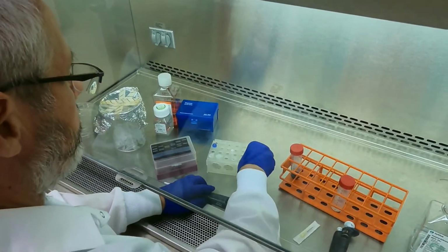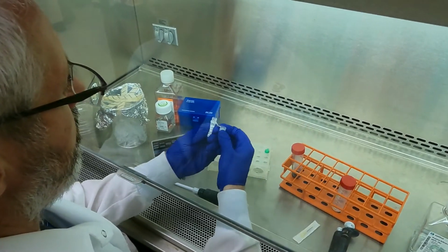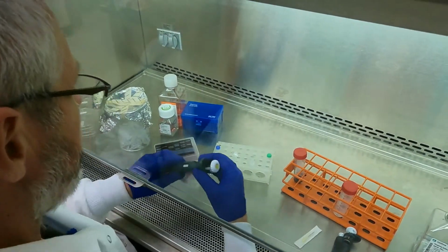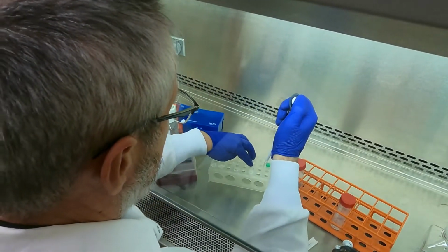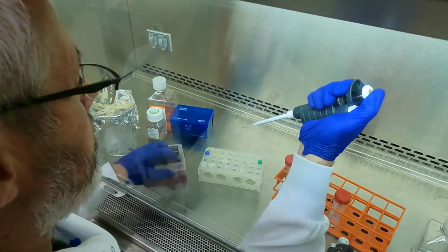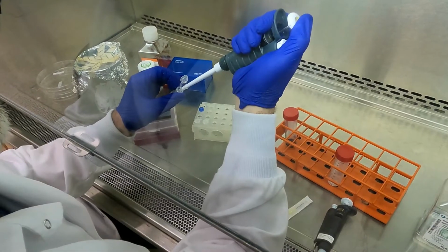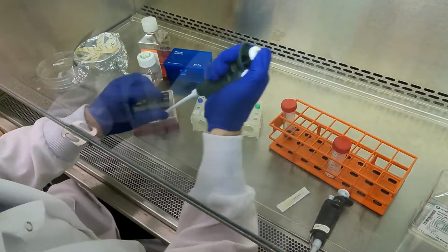This is buffer R, the electroporation buffer from the Neon kit. Fiddly, eh? Good, there's 100. And just mix. Okay, good. There's our mixture.